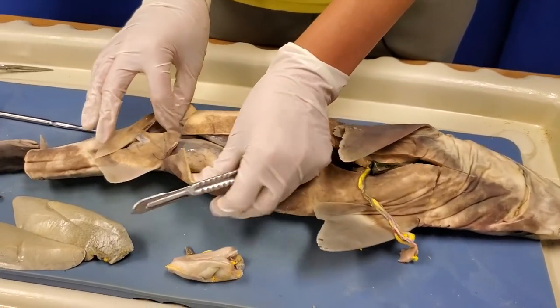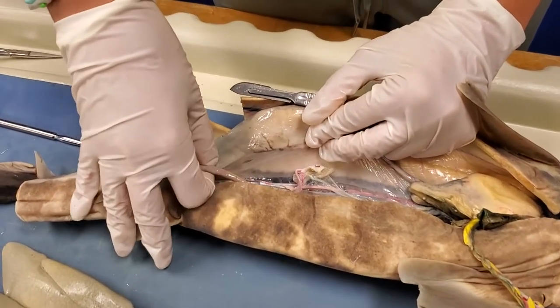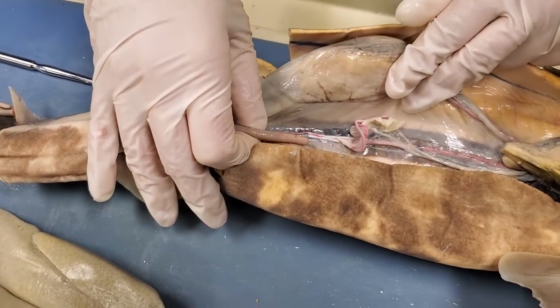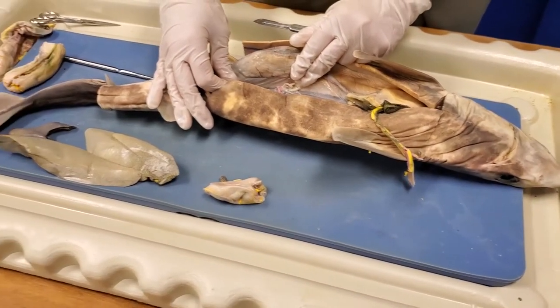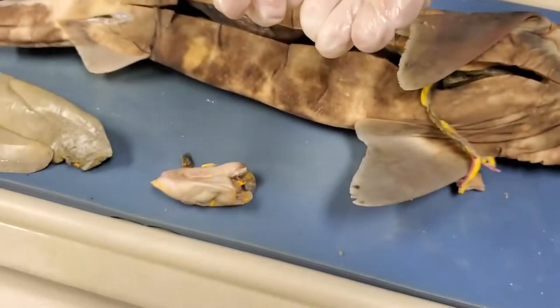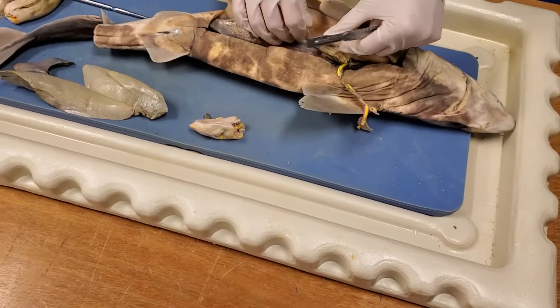Now that I've cut the digestive tract out of the way, one more thing to point out is something all sharks have but that's especially important for bull sharks — what makes the aquarium so special. This right here, between my fingers, is called the rectal gland, and it's responsible for osmoregulation — a fancy way of saying it controls the amount of salt in the shark's blood. This is what enables bull sharks to swim between freshwater and saltwater. Every shark has a rectal gland, but only bull sharks are skilled enough at using it to swim into freshwater.